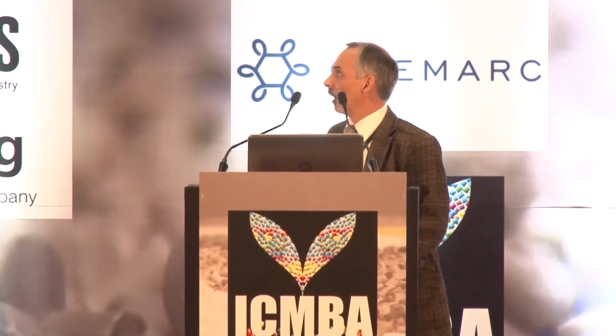Yeah, thank you very much for the introduction and the opportunity today to talk about the testing methods and the quality assurance for thermoplastics and master batches. I will tell you today some examples about the pressure filter test, film inspection, and rheometer.